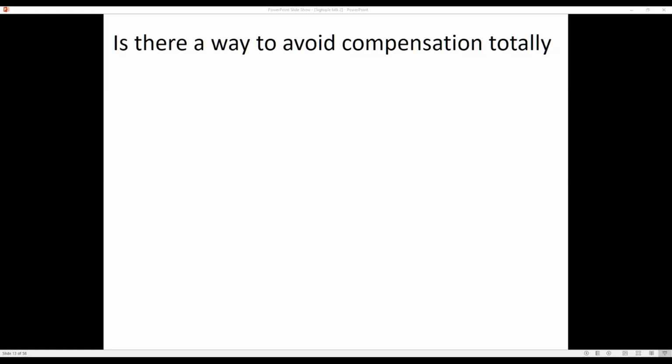Dr. Rasha is there, so Rasha, she wants to try. Is there any other way you can avoid compensation? Yes, we can use the laser delay to eliminate the spectral overlap. Perfect. The other thing is you can distribute the fluorochromes across different lasers. In that way, you can avoid compensation because you can use the laser delay, right?